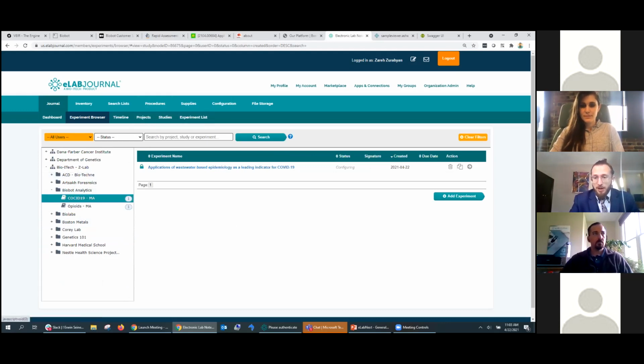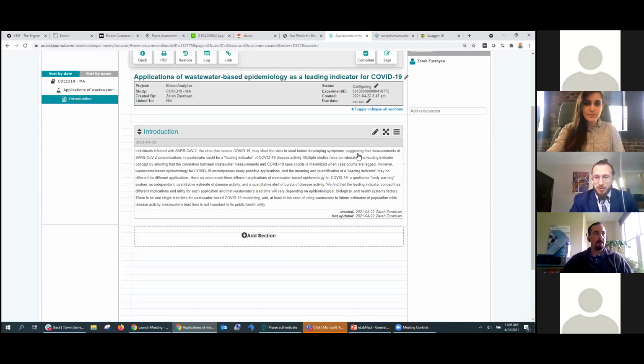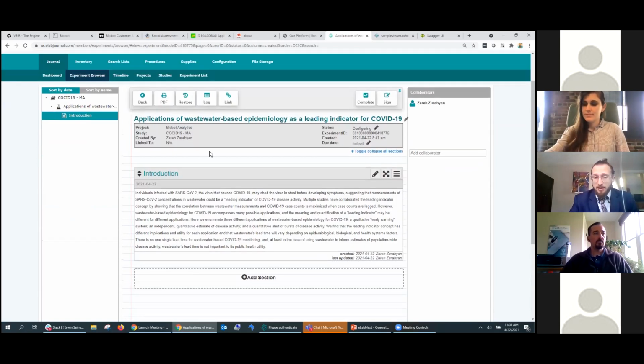And now in here, I can go ahead and add, I have created this new experiment, and I put my introduction in here, which is just a text intro. I have all of this information that's embedded in here. And of course, these are all things that are searchable as well. So the more data that you put in here, the better place you will be in the future to search things by keywords and key ID identifiers.